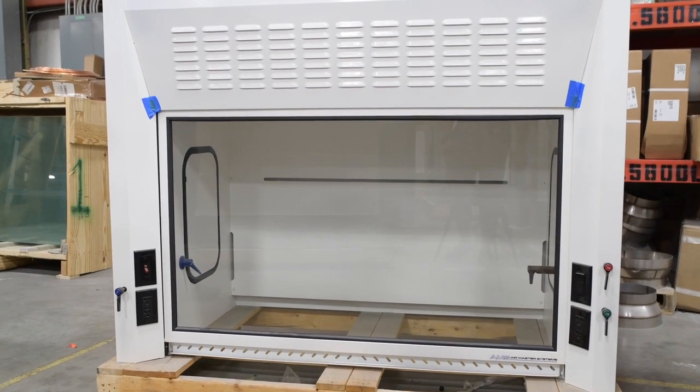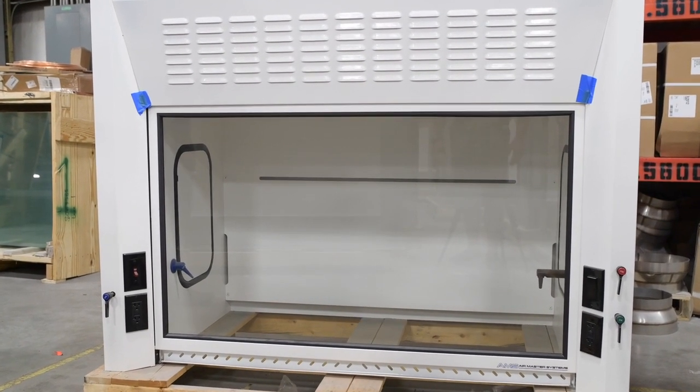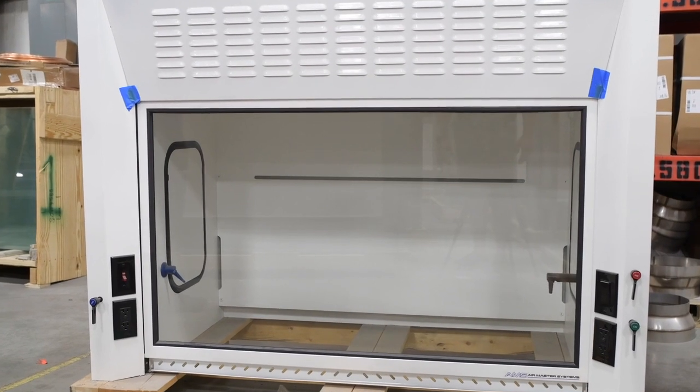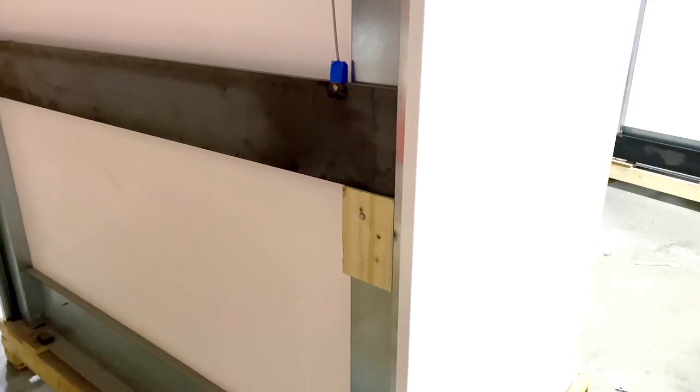To replace the sash glass on an eliminator hood, all you have to do is work from the front. If you have a solution series hood, you will need to remove the top panel first.